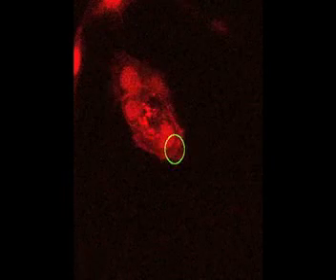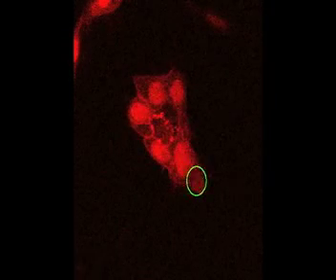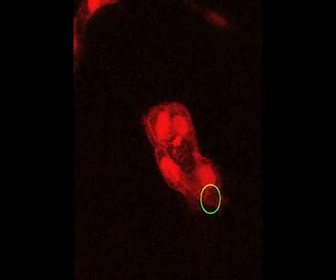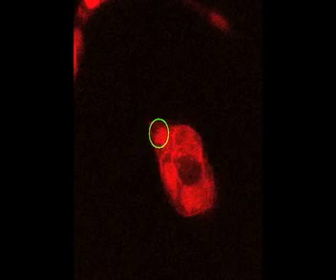Here we wanted to see if we could make the cluster move in the completely opposite direction compared to its normal direction of movement. So at the beginning of this movie, he's actually illuminating at the natural front of the cluster and causing them to migrate in their normal direction. And in fact, what happens is that they migrate faster than they normally would in that direction. But we can see the very dramatic extension of protrusion directly under the laser light.